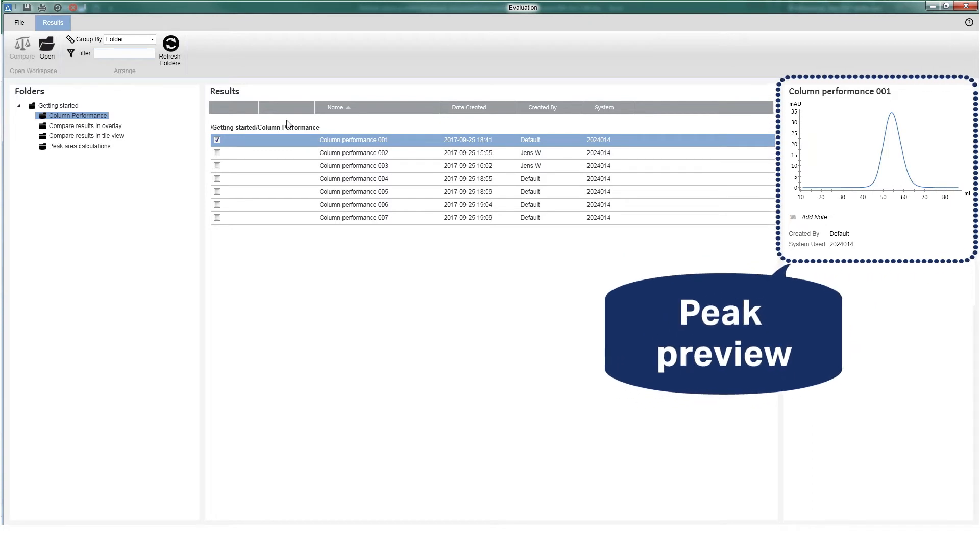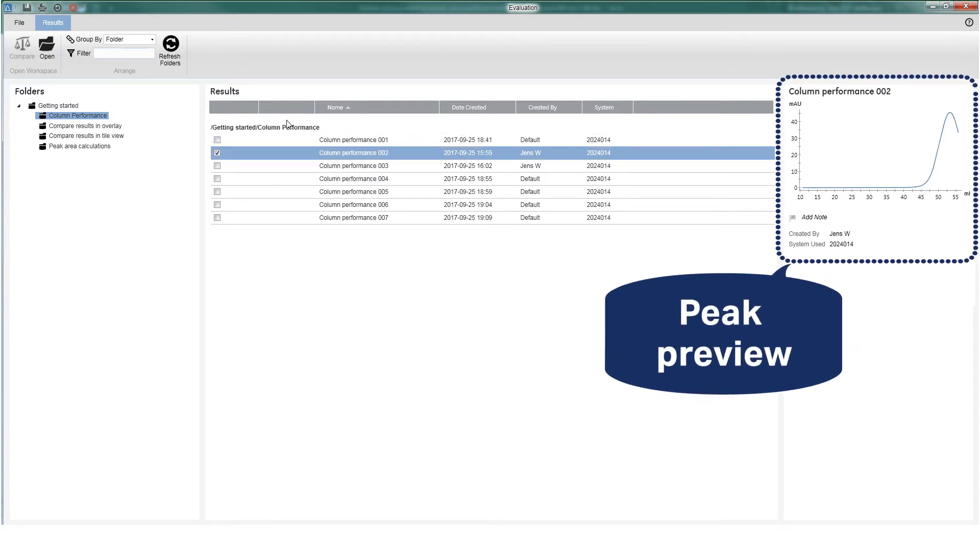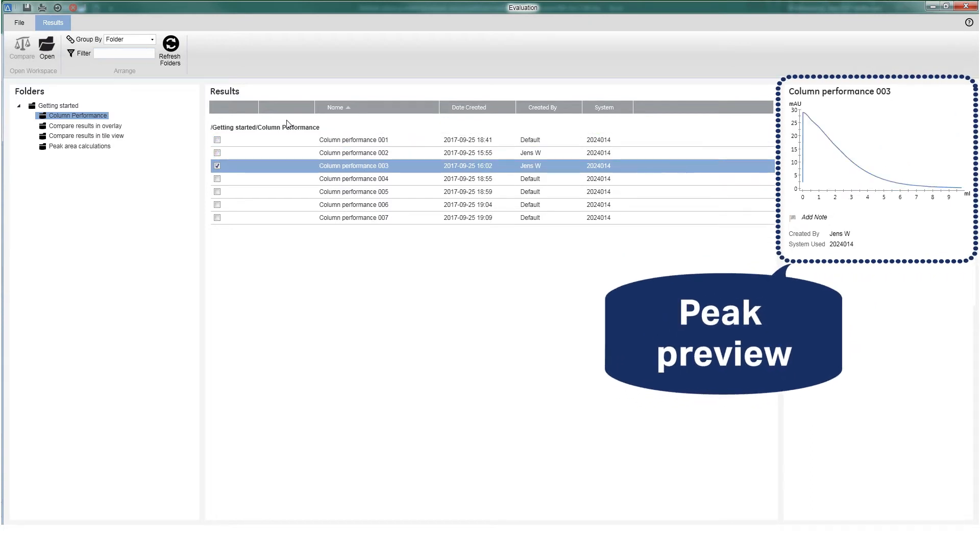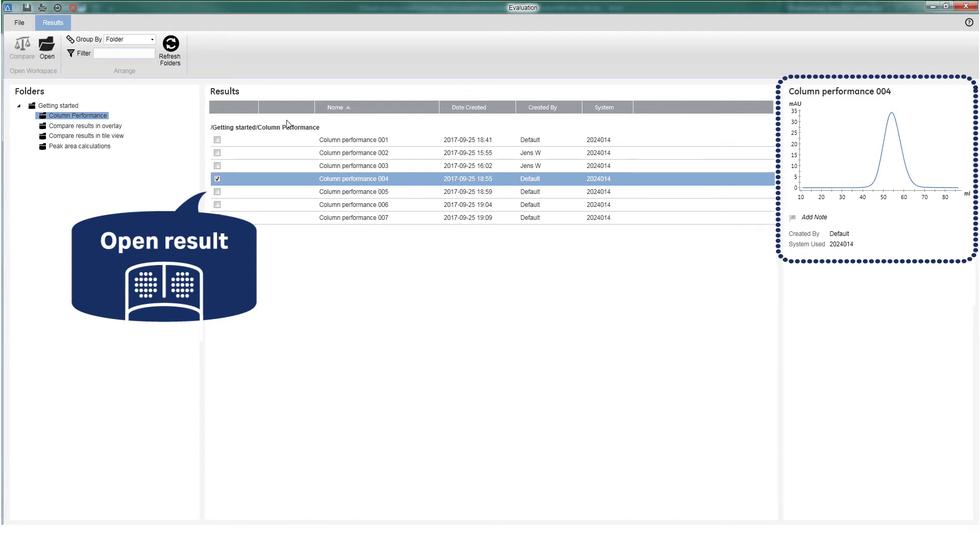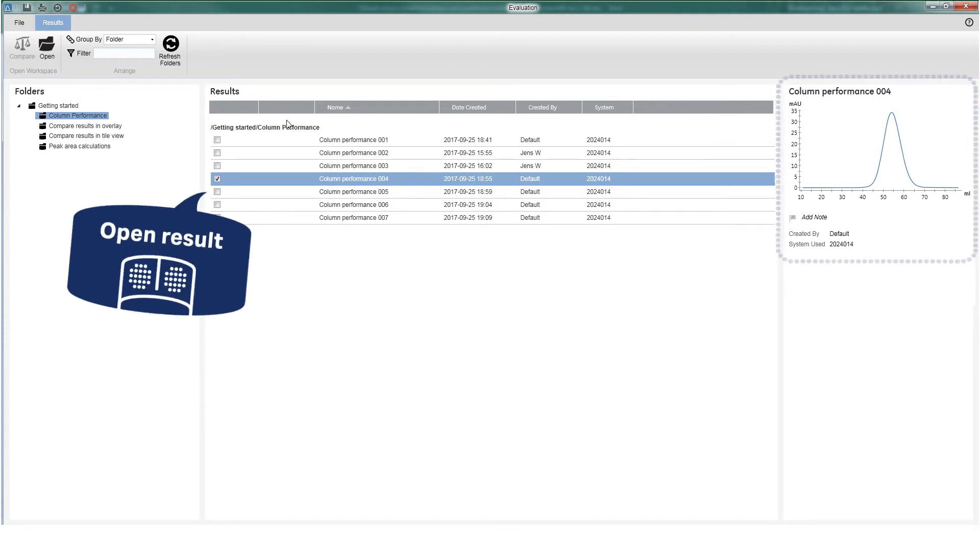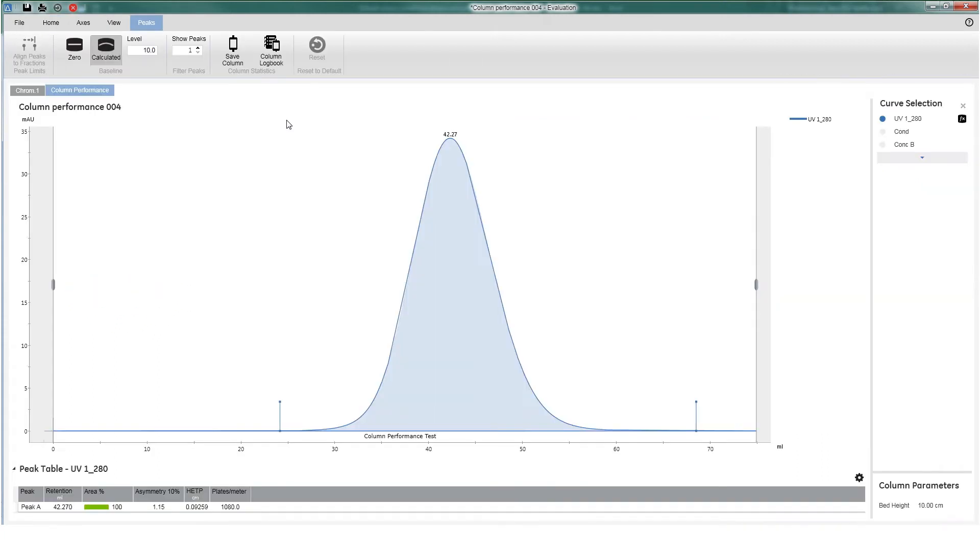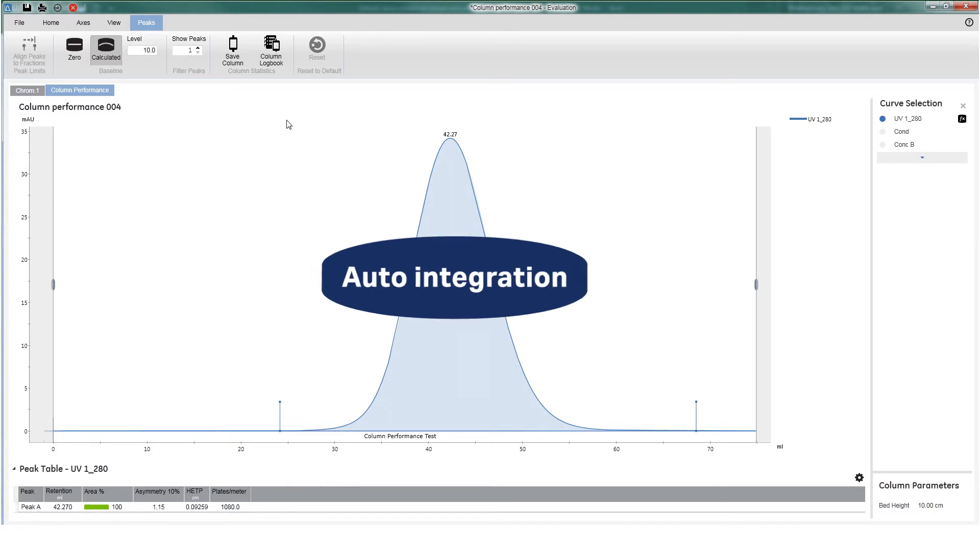The preview gives an insight on how your performance peak looks. Opening the result gives a direct view of your peak of interest. The peak is automatically integrated.